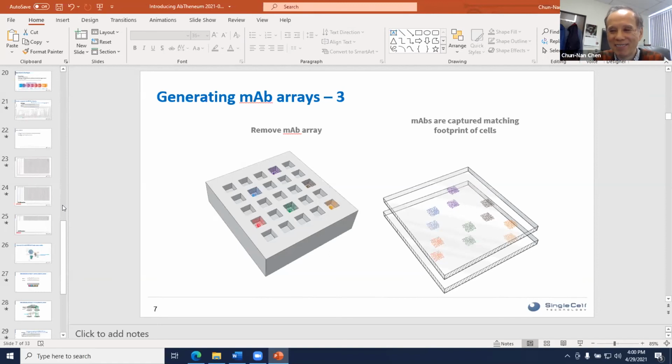Sure, yeah. And you also target multimers because I guess they look a little more in vivo, like what occurs in nature. And so it's something that would be more biologically useful in the long run, right? Yes. And some people really look for special epitopes, the ones that are difficult to target but are biologically or therapeutically relevant. This is where we're not the expert, but those people who are really into target biology have figured out that that's the epitope they want to target. And so those are the more challenging projects that we end up getting.